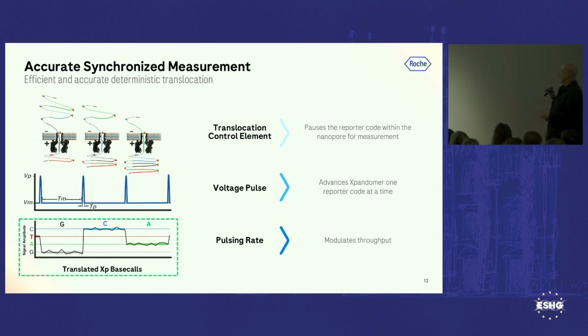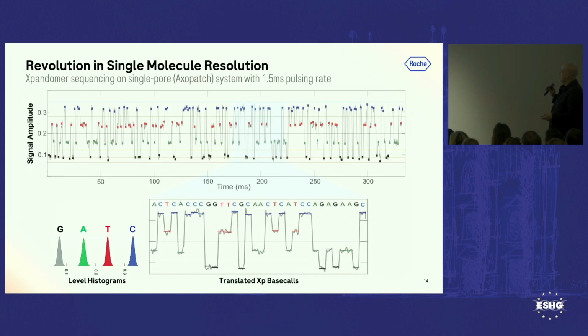When we first made the company, it's actually many years later, we drew this up. That's actually a drawing of what we wanted to do, and this is the dream of what we tried to do. And a mere 5 or 6 or 7 years later, this was actually a real expandamer trace once we figured out how all the elements that had to come together to make these expandamers.